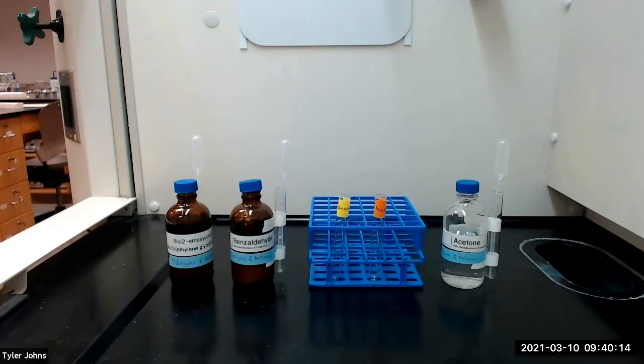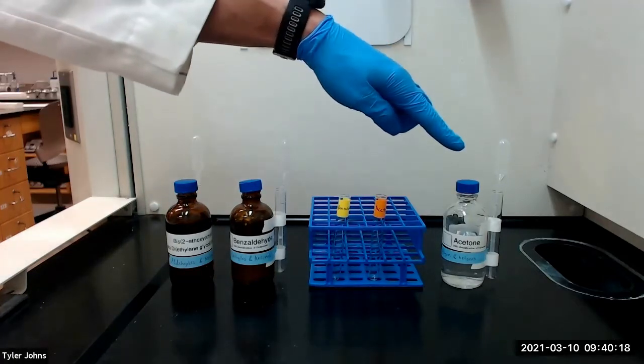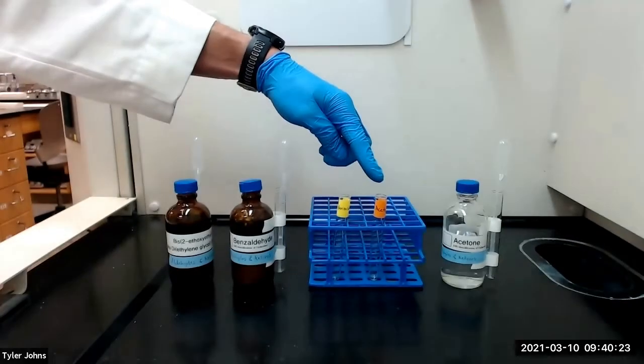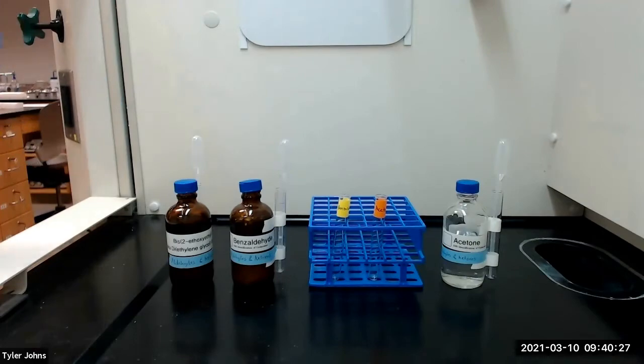We will practice the Tollens test with two known compounds, benzaldehyde and acetone, and we will begin by dissolving a couple drops of each compound in separate test tubes with a minimum amount of diethylene glycol diethyl ether.